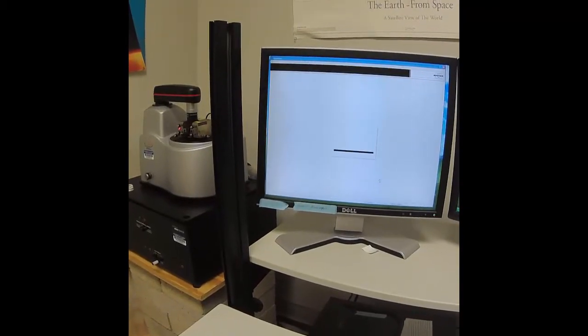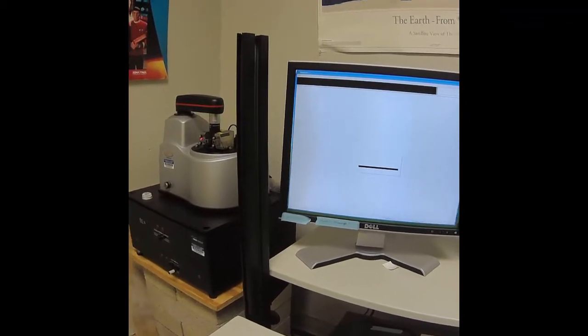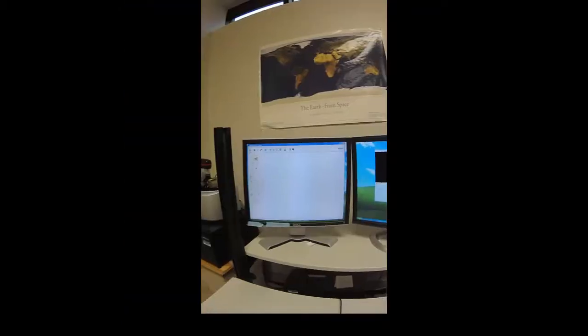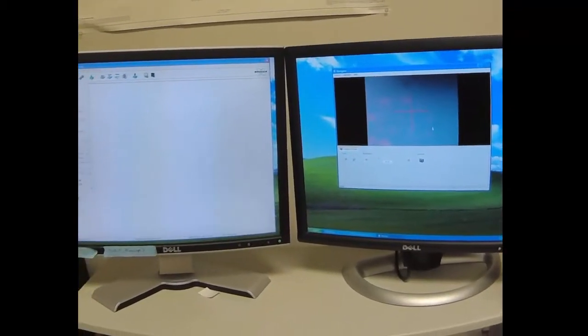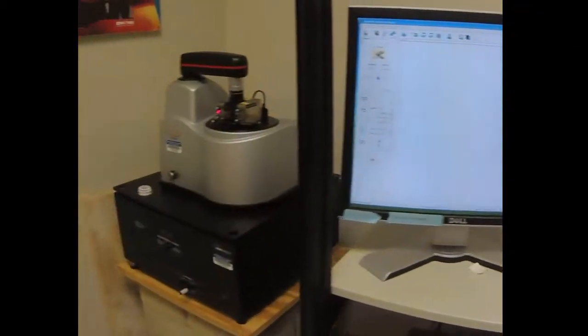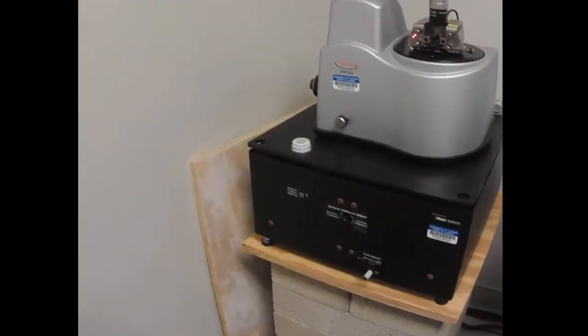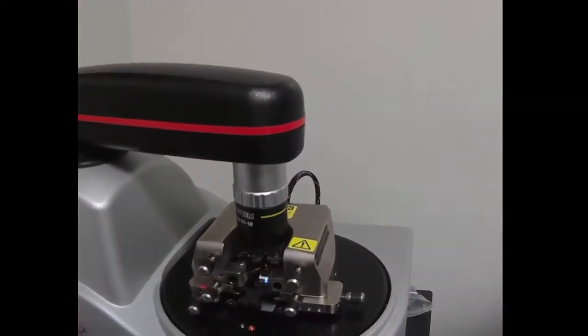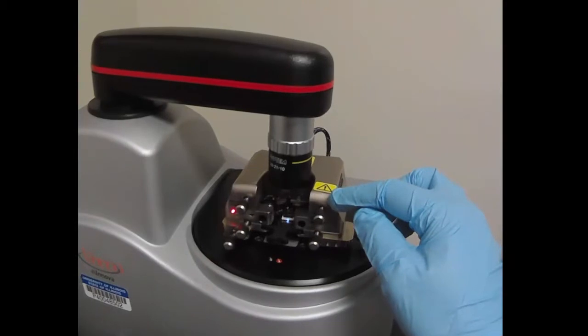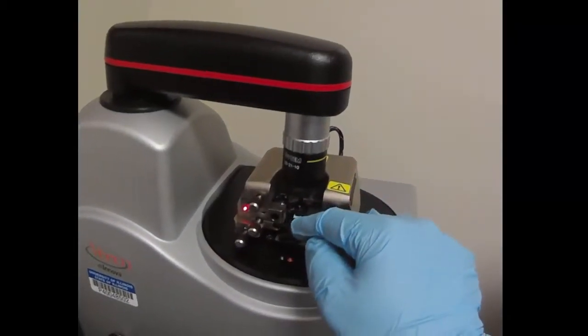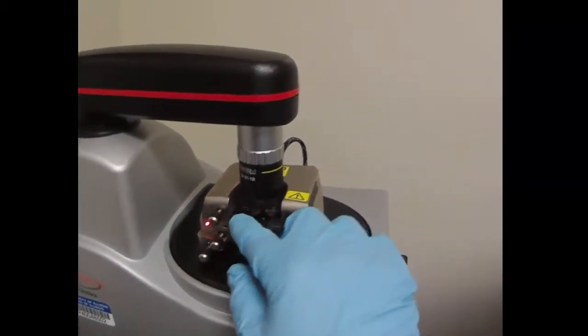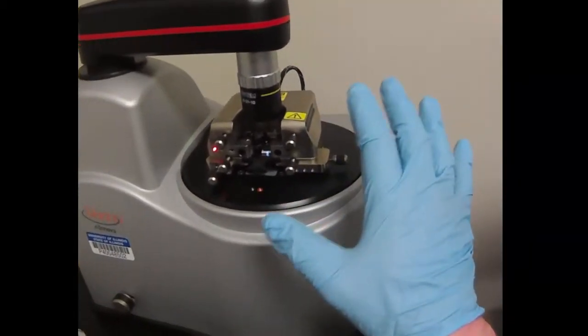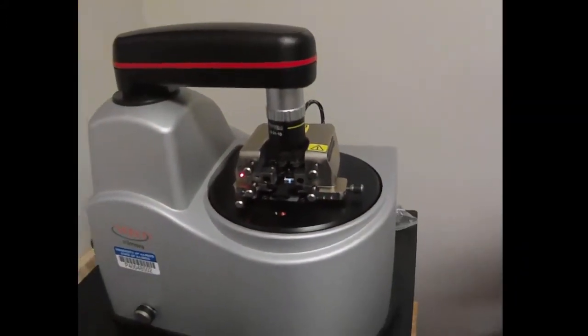The computer is going to look at what were the settings the last time tapping mode was used with the large area scanner. To use the software to collect the data, we need to first make sure that the instrument is aligned correctly. As I mentioned in the setup, there's an aluminum backing on the probe and we need a laser from this side of the scan head to come down, bounce off the back of the cantilever and go up this side into a detector. Before we can collect any data, we need to make sure the laser is aligned.